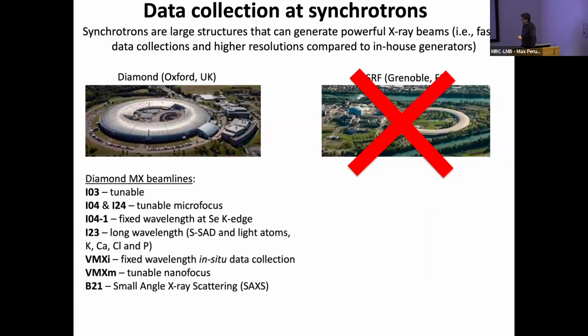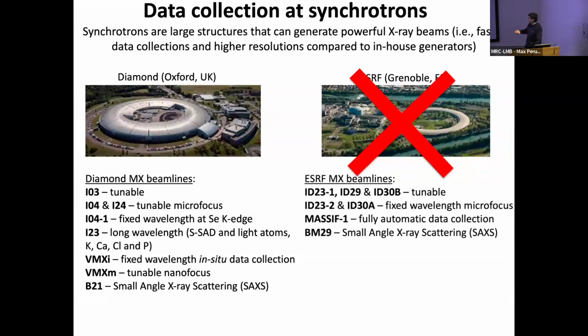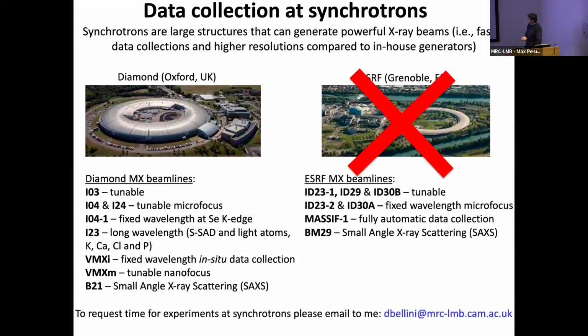There are all sorts of different beam lines to fit different needs. I will not go through this. I will discuss this when and if you have crystals. Same for Grenoble, but we are not using it anymore. If you want to get time at the synchrotron, please just give me a shout. We'll schedule a session there, either remotely or physically, if you are interested in seeing the beam lines.